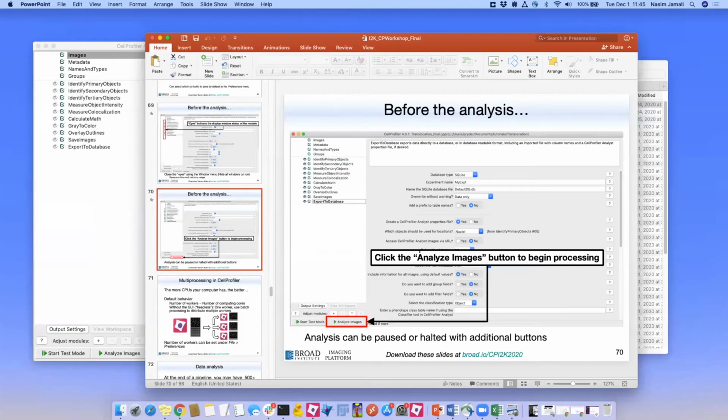Any questions so far? No? Ready to go back to the breakout room and start working on the rest? Sure. Yeah. Yeah, nice. Did you all get to run the analysis? Yeah, we were able to. Yep.